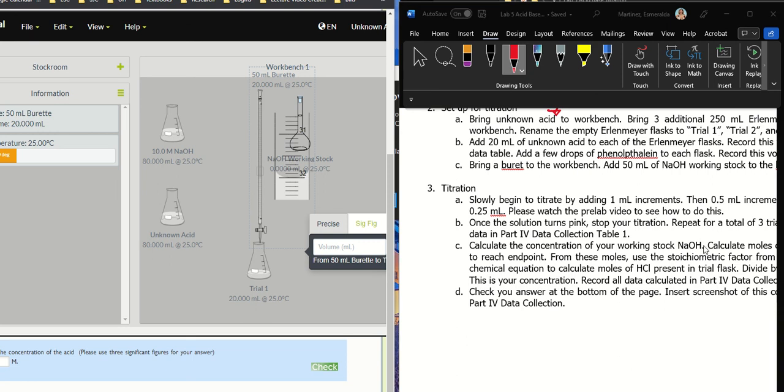And then you're going to add in a little bit at a time. That's what we mean by titrate in. So start with the 1 ml increments. Oh lord, these notifications. The 1 ml increments, then 0.5, and then slowly, slower and slower. Okay? And I used to have a different video where I showed this more in detail, but there's not really much to it. You know, just enter the volume here. 1 ml, 0.5, then 0.25. You can also do the realistic version of this where you click it and do 1 ml and then click it, but it can kind of backfire in some ways. But anyway, you're going to do this. Once your solution turns pink, stop your titration.